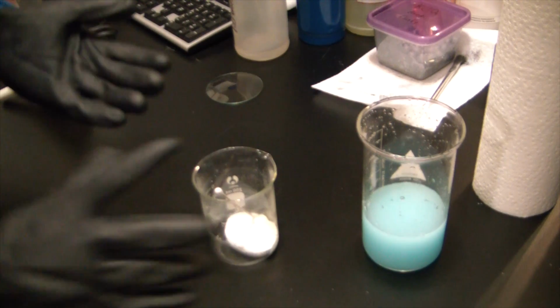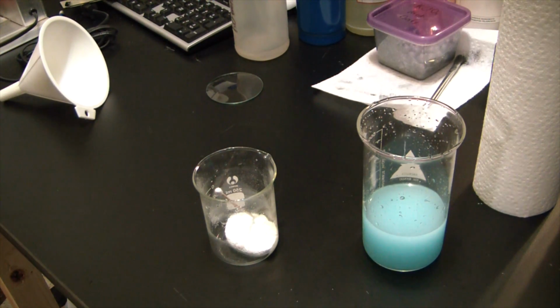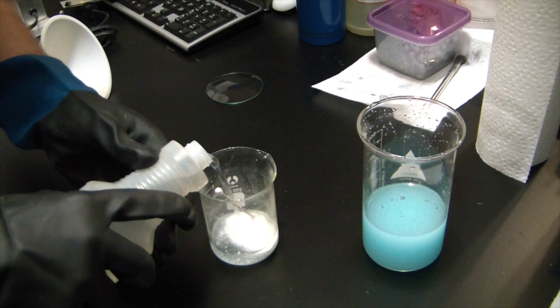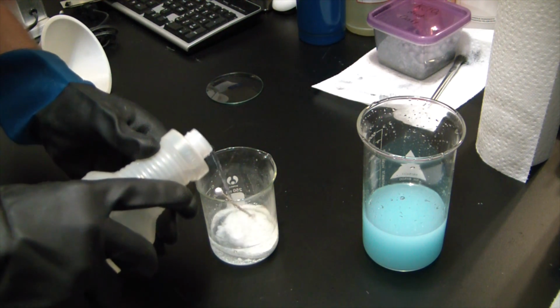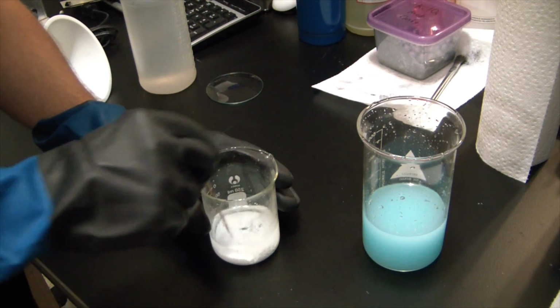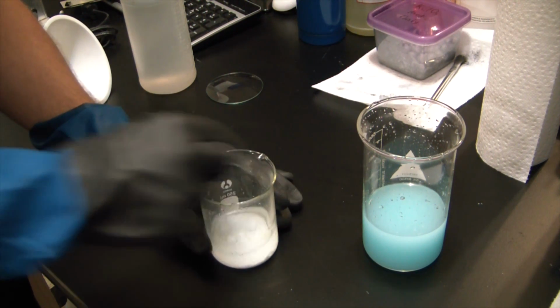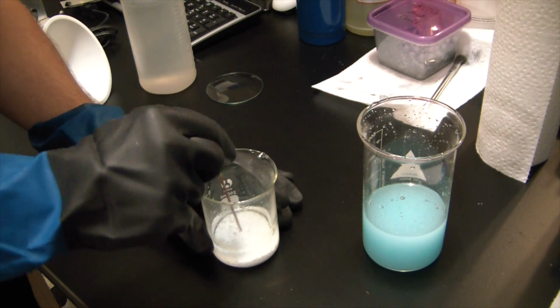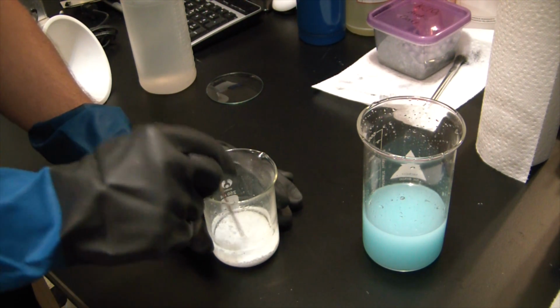Alright, going to give that a couple washes just to get rid of as much of the remaining copper as possible. Just going to add some water. Give it another rinse, get rid of as much of that copper nitrate as possible. Sure, I'm going to lose some more silver in the process. Try to break up some of the big clumps.